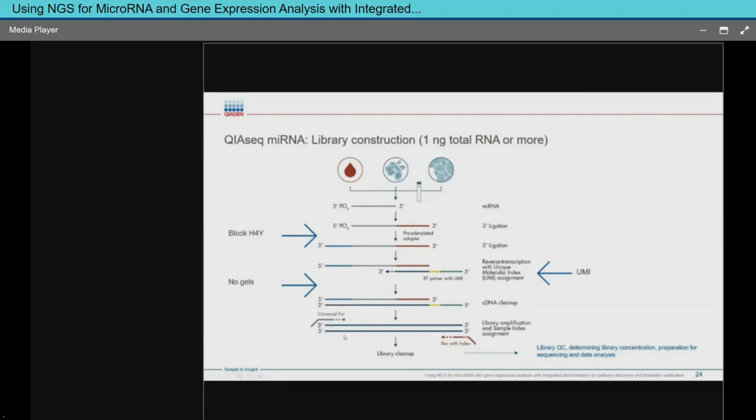Lastly, for indexing, we use a PCR type indexing. At this point, we're incorporating the indexes that will be specific for your platform. So whether it's Thermo Fisher or Illumina, most sequencing that I see comes off of the Illumina platform. And this is where you can pick the indexes that you're using.